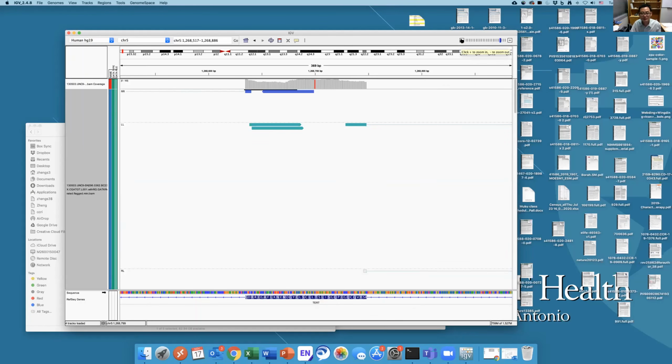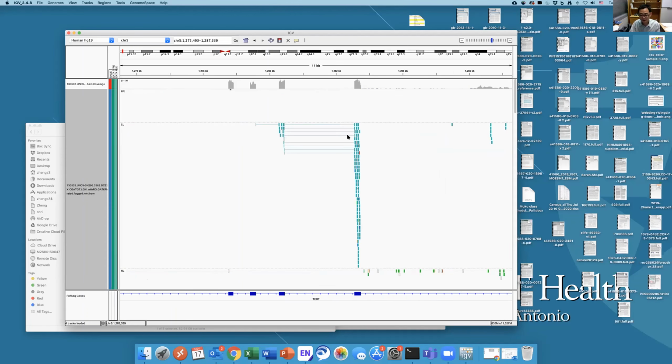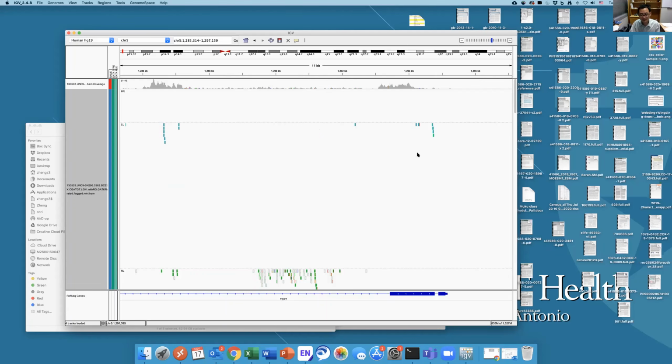But be careful with mutation analysis in RNA sequencing. Like I said, because the cDNA reverse transcription can introduce artifacts which would appear to be variants. So in general, calling variants from RNA sequencing is less reliable than calling them from DNA sequencing. Okay, so that's pretty much it.